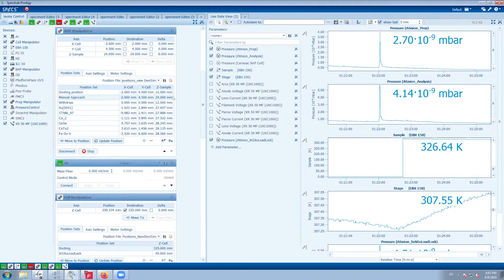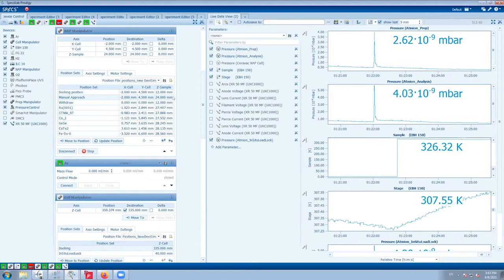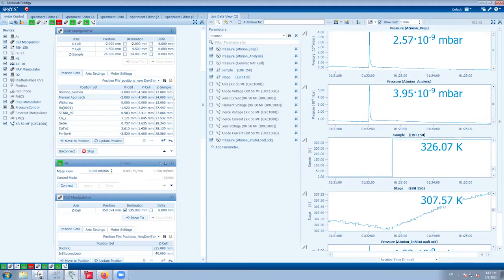It is made from very thin copper, because they wanted to make this small hole. As soon as you just touch it, you don't even need to press, it is already blocked. Then you need to take it out somehow, maybe unblock it, or maybe use some drill to fix it. We did it twice, and it was not very pleasant.